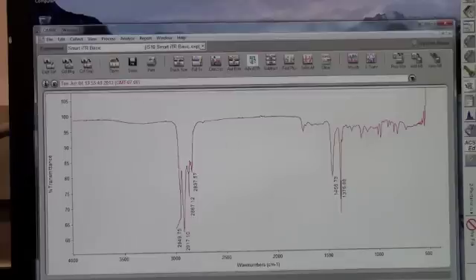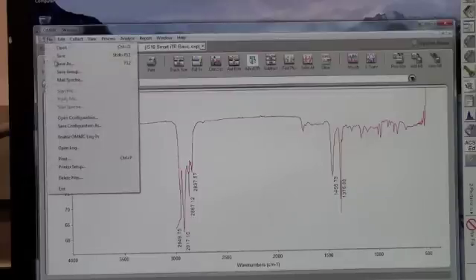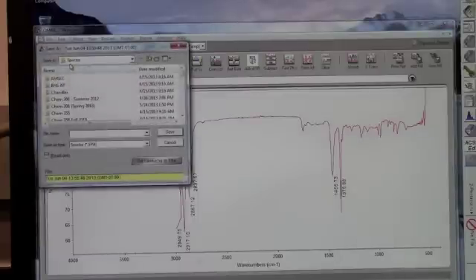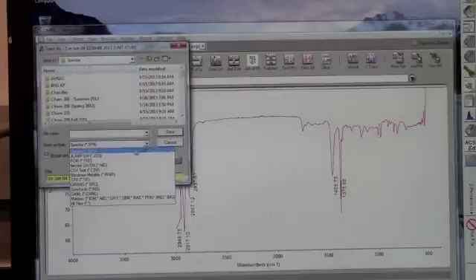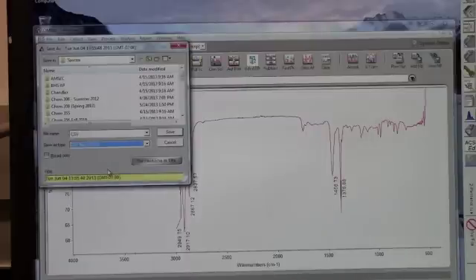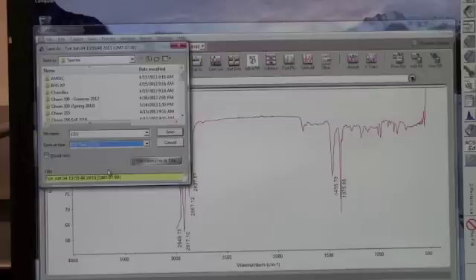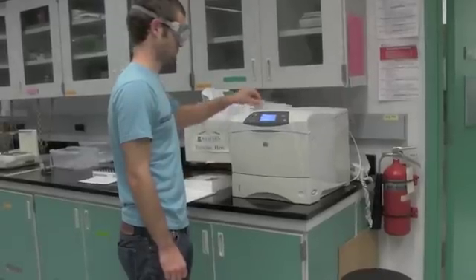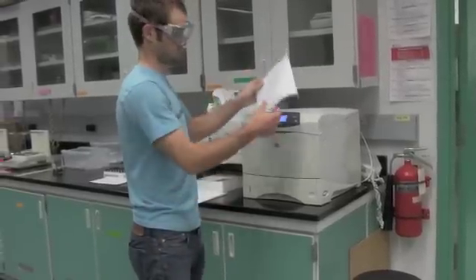The final step is to save this file to a location of your choice and or print out the graph. The graph should be saved as a CSV file. Saving the graph as a CSV file will allow it to be quantitatively analyzed later on. If you wish to obtain a hard copy of your spectra, a printer is located against the wall near the FTIR machines.